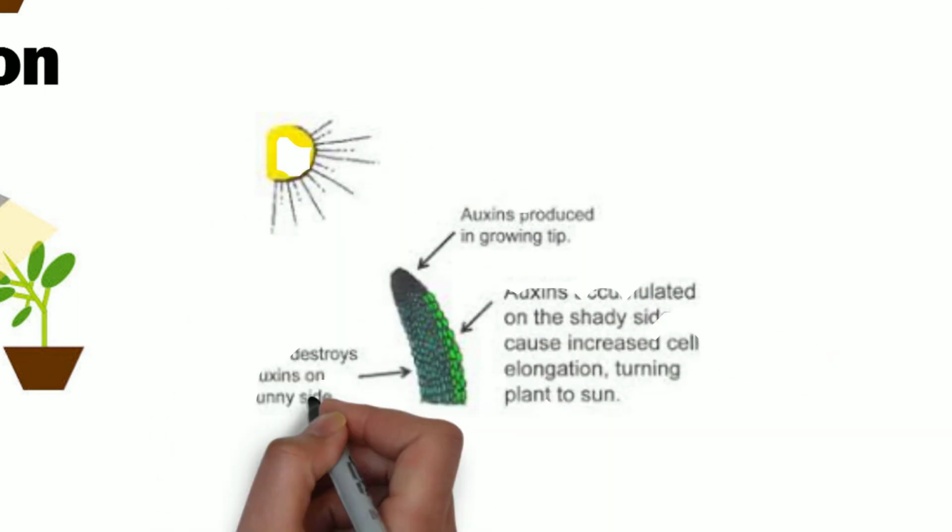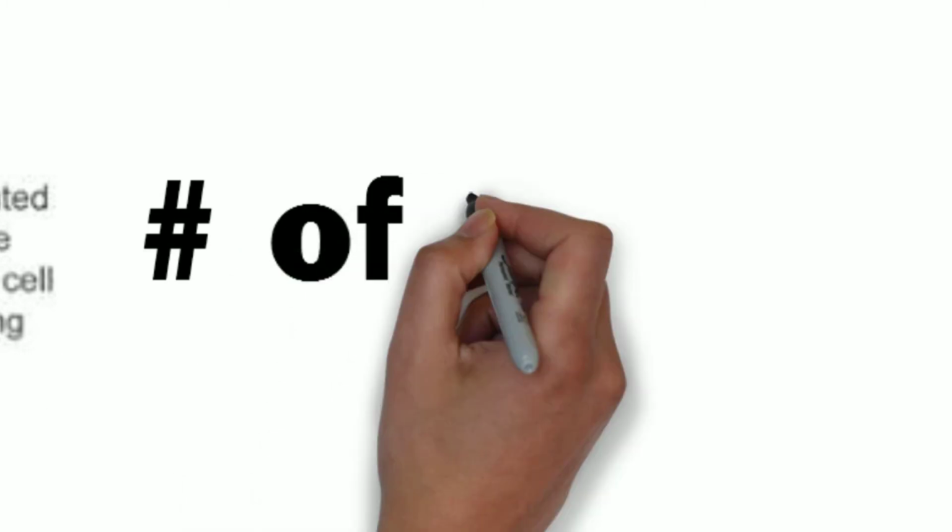To create a more reliable experiment, more trials would have been beneficial and a greater amount of time for the plant to grow.